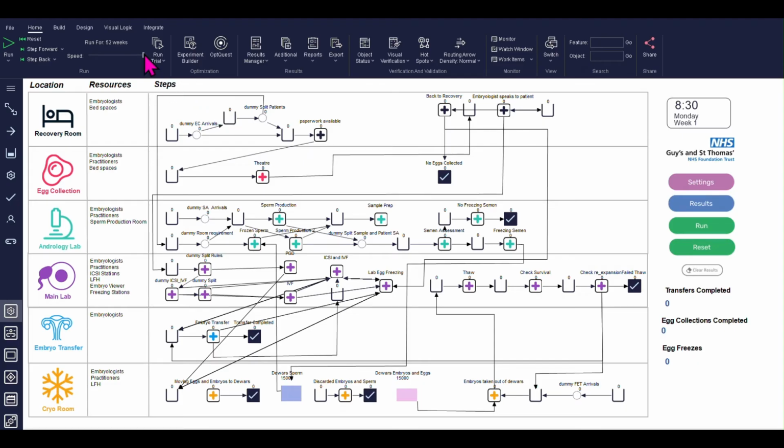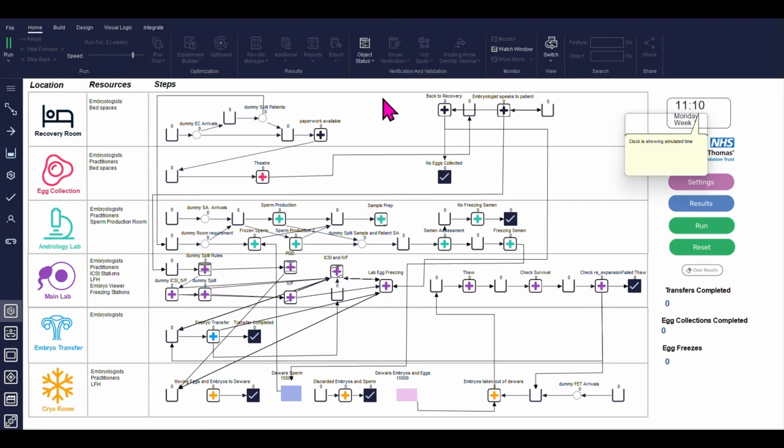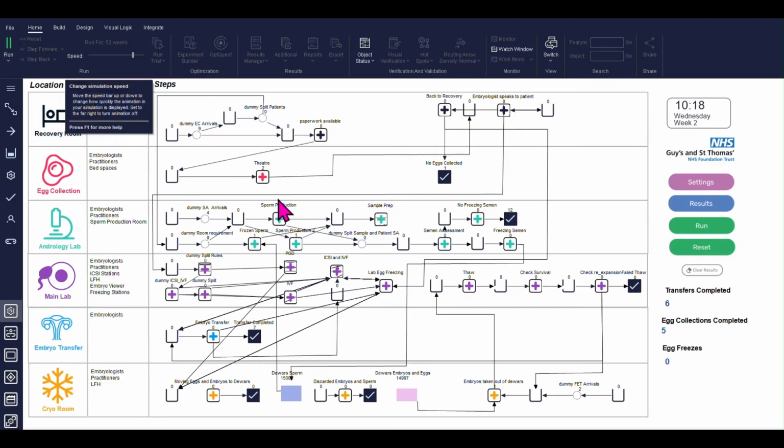So suppose that we can reduce the speed here, we will be able to see, and we run the simulation with a random number. The simulation will run and we can see here all the tasks flowing, and we can see the clock as well moving. The clock will move very slowly to start with because we have chosen a slower mode. We will see the buckets filling as well. It will allow a visual check of how everything is run.